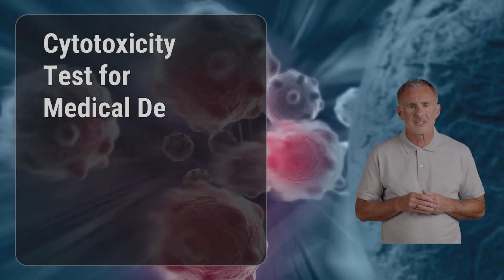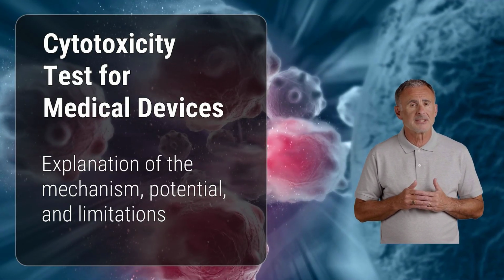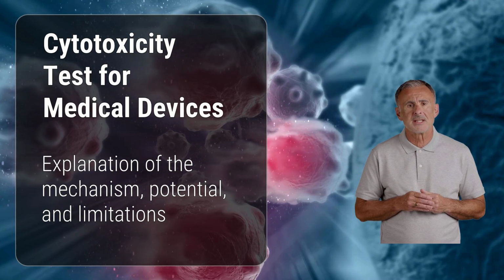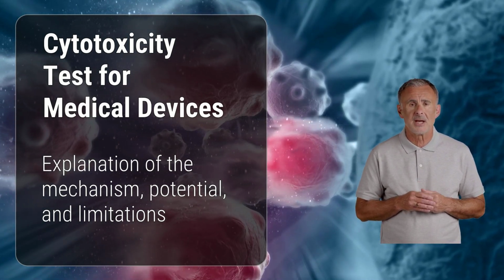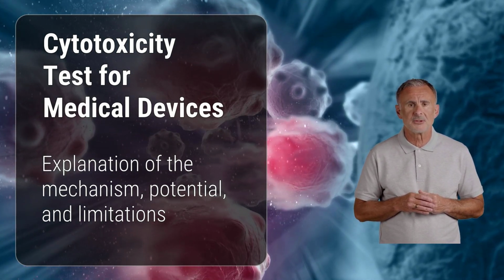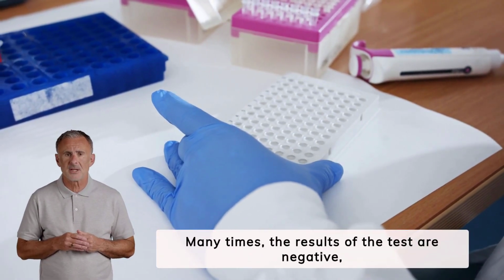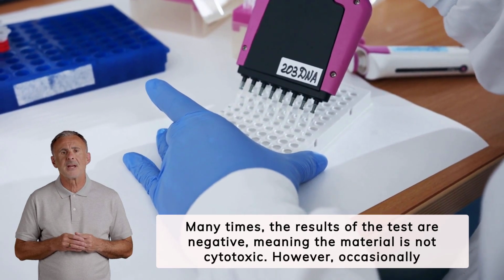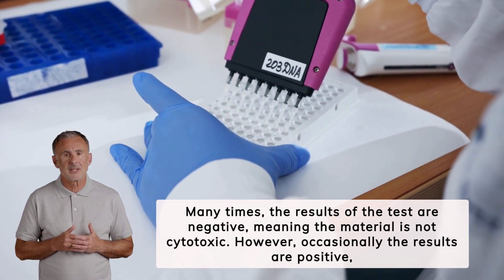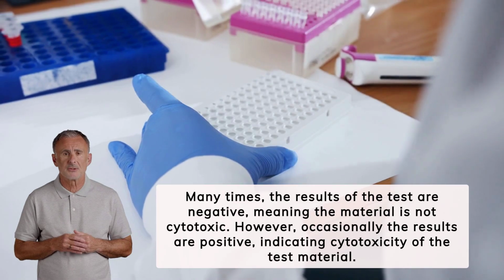In biocompatibility evaluation of medical devices, several in vitro and in vivo tests are performed. Among these tests, cytotoxicity testing is generally considered a simple first-line screening method. Many times the results of the test are negative, meaning the material is not cytotoxic. However, occasionally the results are positive, indicating cytotoxicity of the test material.